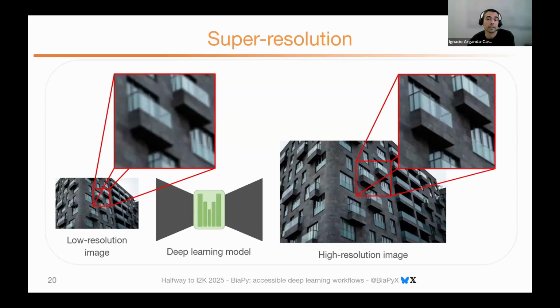This is something that could be directly extracted, for example, from instance segmentation. You can get the boxes. It's something that is related. And in instance segmentation, we actually sometimes also detect the centers of mass. But we don't use boxes for that, because we want to use the same workflow or the same idea in multiple dimensions.